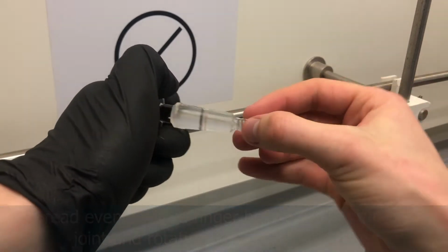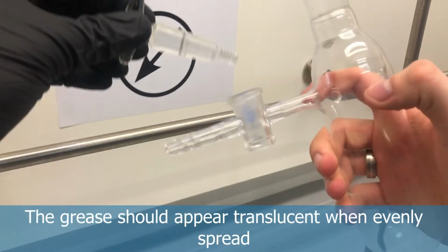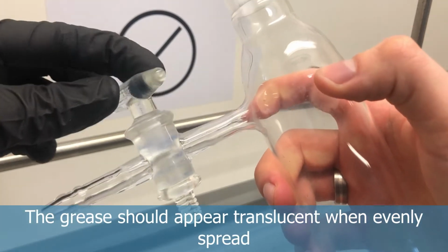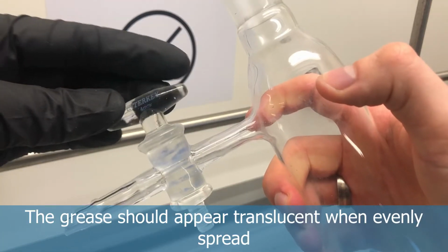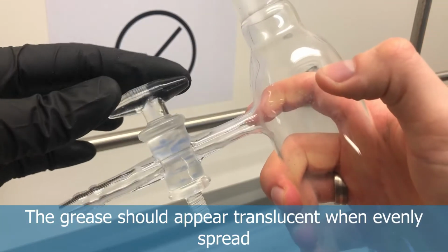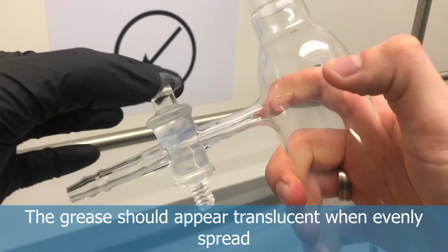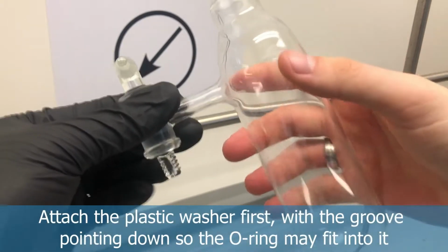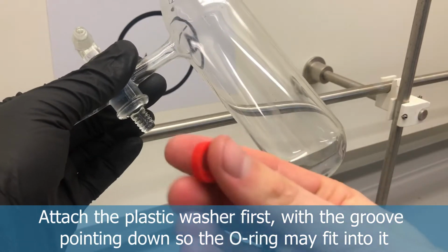So we can fit this into our arm of our Schlenk flask, and we're going to rotate it around until it goes translucent or fairly clear. And it's important that we spread it evenly, as any gaps in the grease can leak in air and will increase our pressure. And then once it's in there and been rotated around, we're going to fit our plastic joints to secure our tap in place.